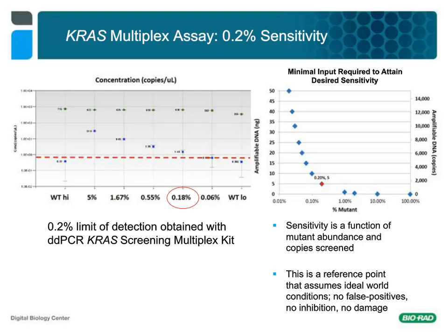The KRAS mutant DNA, indicated in blue, was run in a threefold dilution series in a constant background of about 40 nanograms human wild-type genomic DNA in green. This established sensitive single-well detection of KRAS mutations down to 0.2%.